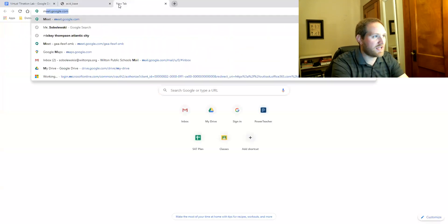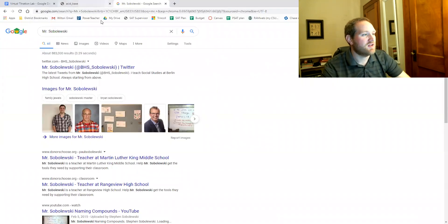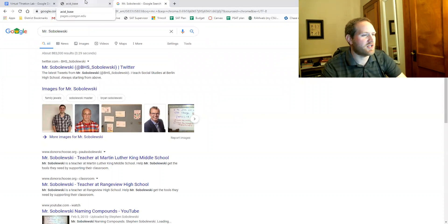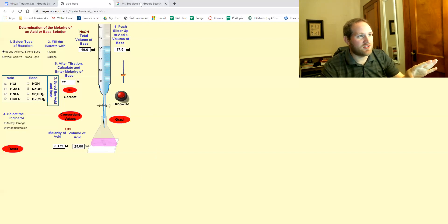put your name. These people aren't, you do your name. Oh, it's my video. And you go back here and your screenshot now needs to include this tab. Just so we know that it's you doing it.